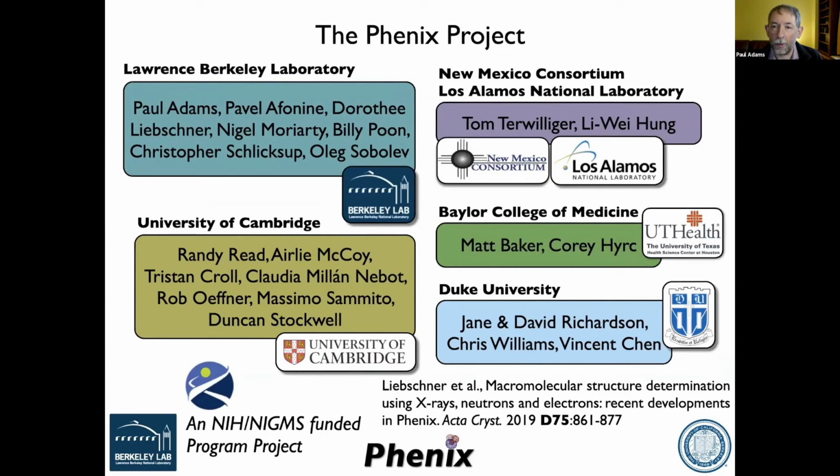I have two more questions concerning that. Since you mentioned the shortcomings, and since we are interested in charges and we are able to already edit our own custom, not very perfect parameters for charged atoms into the scattering tables, what I honestly realized is that scaling to the velocity is not implemented anywhere currently in the scattering tables.